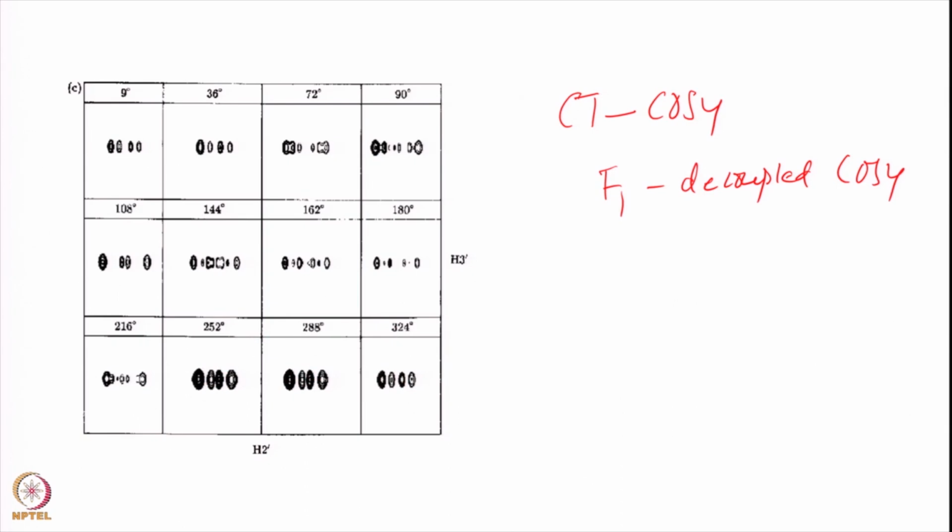And so you can see a better representation of this, more components here. Here actually you see more components. The same is true here. It should be 8 components, and you actually see 8 of them there, because you can separate them better here by relative intensities, but when the intensities become more, they tend to merge, and then you will start seeing this sort of a pattern.